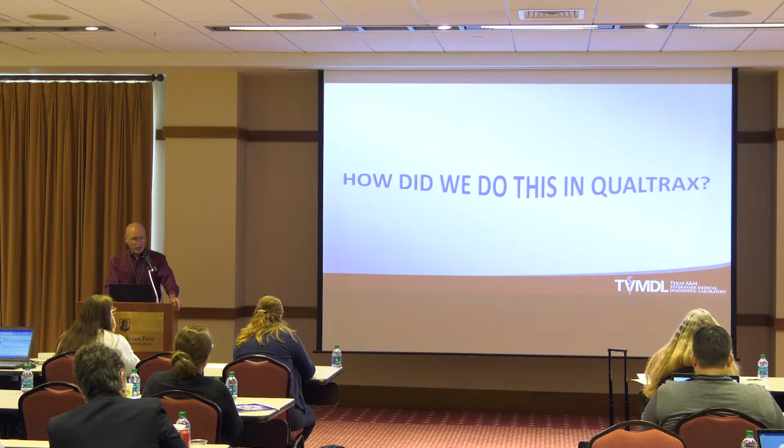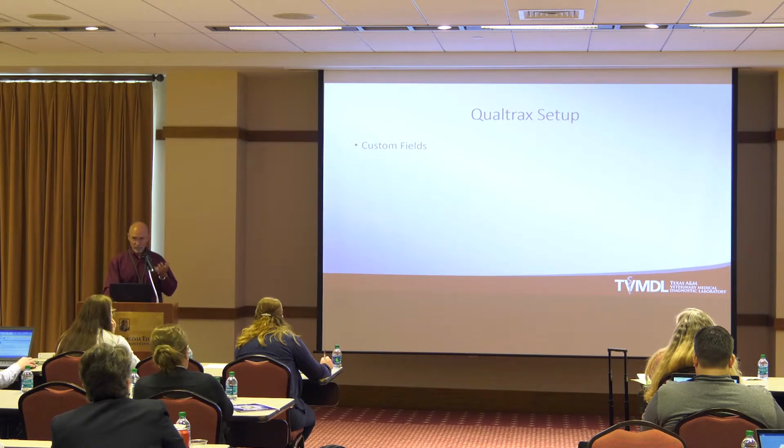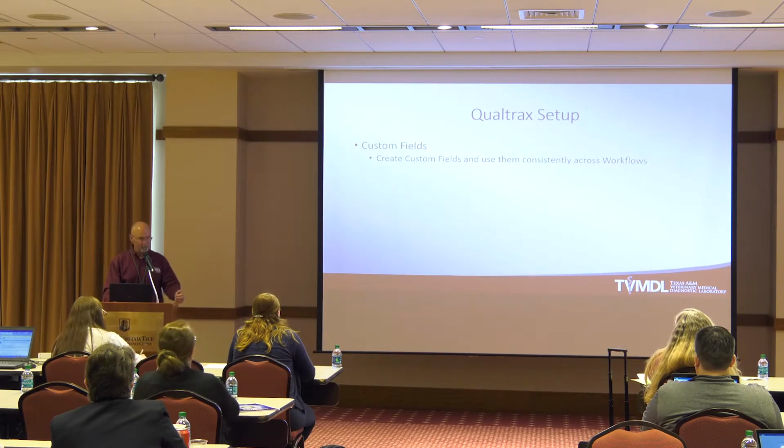So how do we do all this in Qualtrax? So that's what the reports looked like before. That's what we're trying to recreate. So how do we do this? So first we need to set up Qualtrax appropriately. We have custom fields. Custom fields are set up in Qualtrax. You can create whichever fields you want to and then set those up in workflow to collect your information. We use the custom fields consistently across the different workflows. So there's one particular field name for nonconformances, and we use that in all the different workflows.